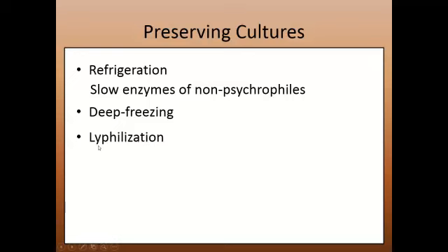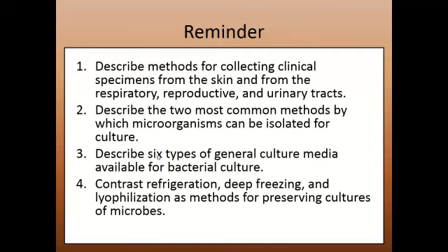Lyophilization is the fancy-dancy term for freeze drying. We freeze them and then we sublime the water off. Then we don't have to keep them at low temperatures. You can keep lyophilized cultures at room temperature, so less expensive. That's it for this topic.